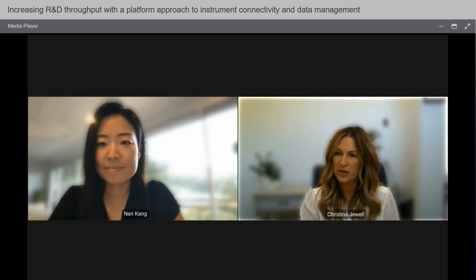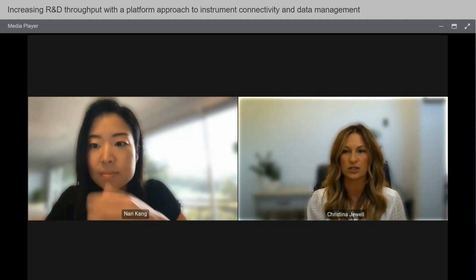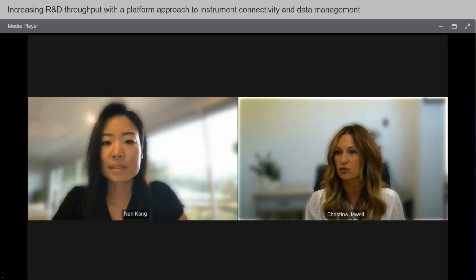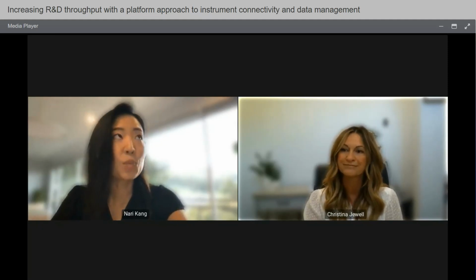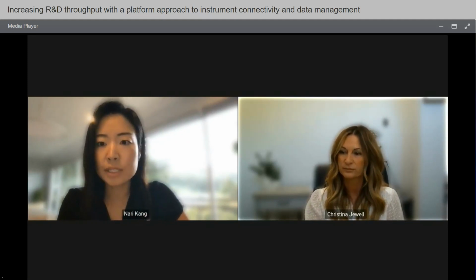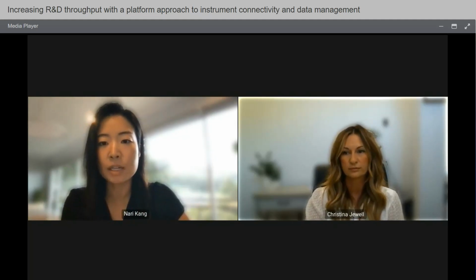Now, Nari, would it be possible to trigger further transformations, for example, aggregation, integration, qualification of the data after it has been converted into ASM or Allotrope Simple Model? Yeah, also a great question. We have a couple of different ways for us to help you with that scenario. The first one is we do have a built-in point and click transformation tooling that you can configure on top of those data. That is something we offer within our platform.